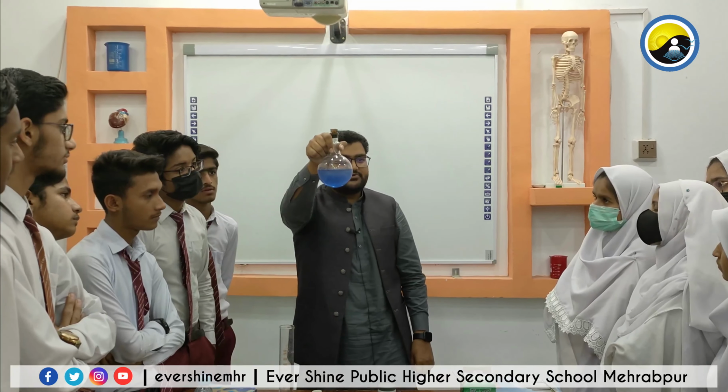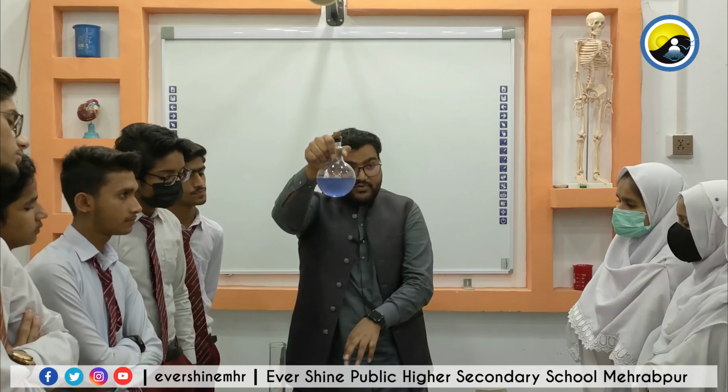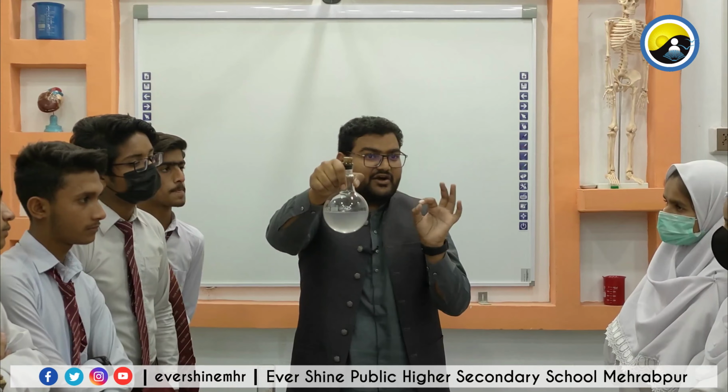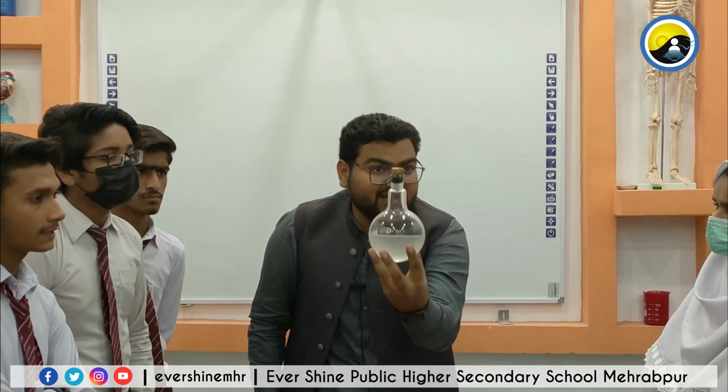So what is the color of the solution now? Blue. Why is it blue? Because the methylene blue present in it is being oxidized. Now you see it is again colorless.